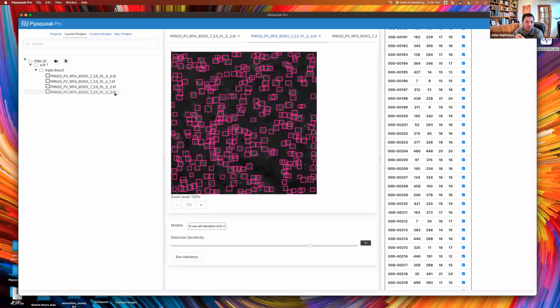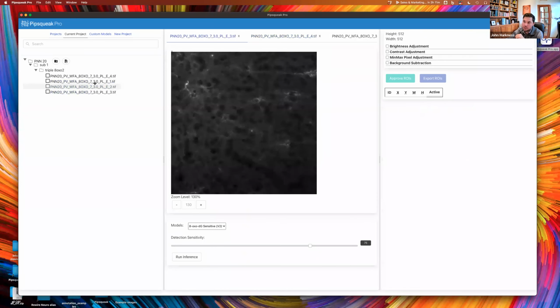And something that we're currently working on is Stacks. Great question. So something that we're working on is an integration with bioformats that will enable you to export what you like, your LIF file out of Leica's software, bring that over, convert it in bioformats and open it up here. Currently, we're not looking at Stacks, but that's something that's going to come online with our co-localization capability. So, for example, I've got 3 channels and a merged image here. TIFF Stacks are something that should be available within that as well. Oh yeah, thanks, Grant. Good answer to that.